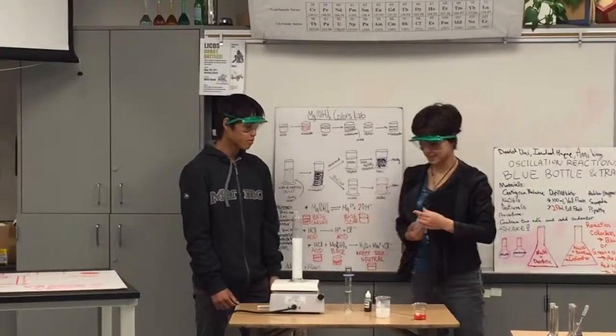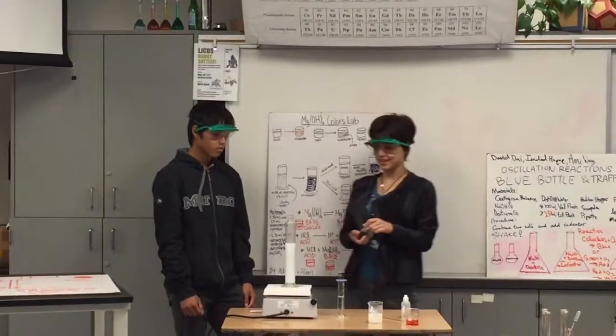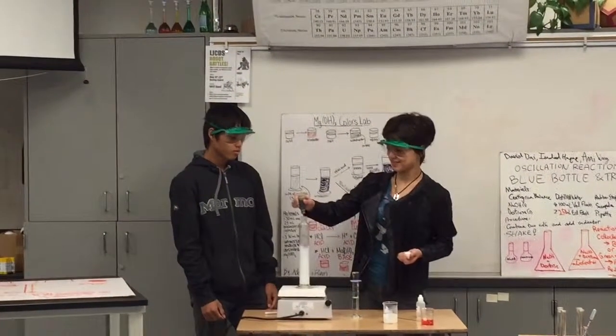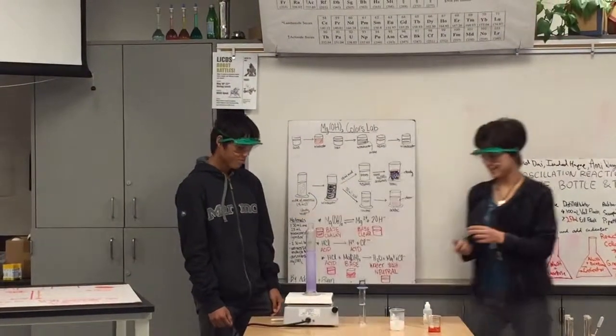And this is magnesium hydroxide, as I said earlier. When you add the indicator, it's a base, so it turns purple.